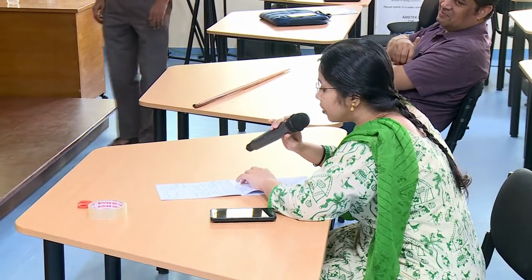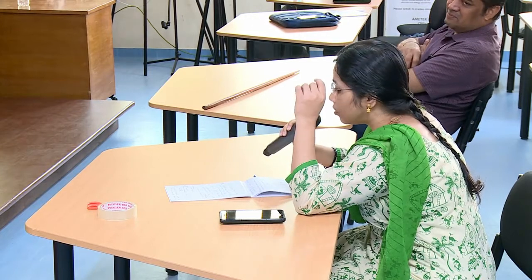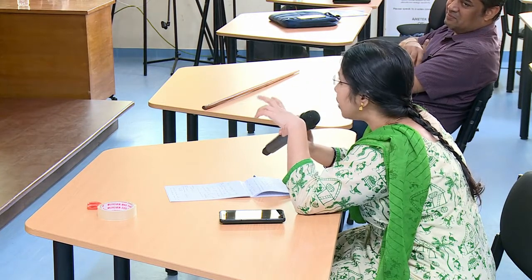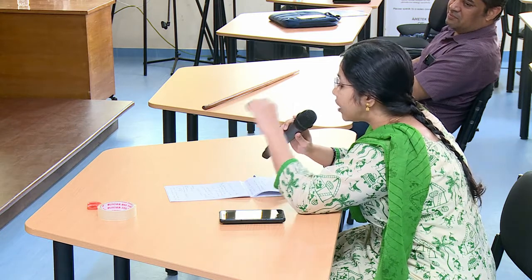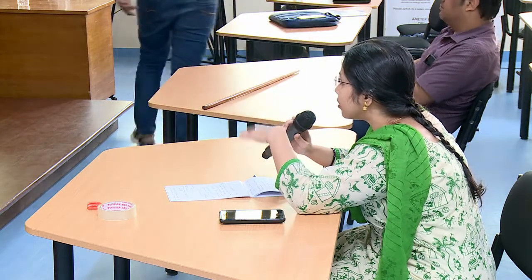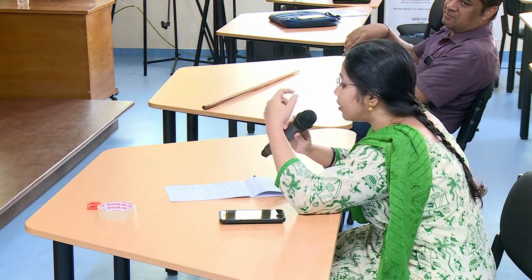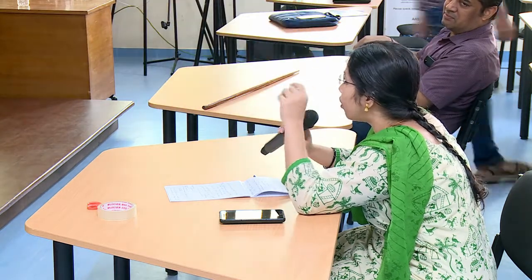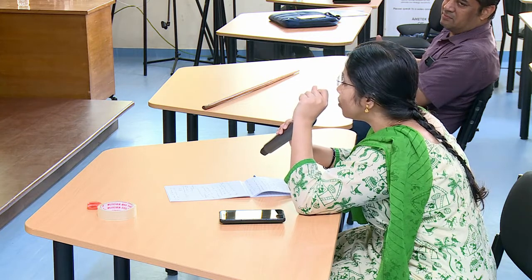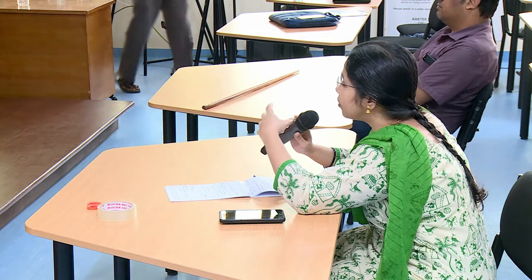I have a question related to the pseudo symmetry which was talked about in yesterday's talk. I have a Laves phase, C15 Cr2Nb Laves phase, in my material, along with multiple phases. When I tried to index the Laves phase with the existing standard files that were available, I was not able to get it indexed. I tried to generate a pattern, but it was just coming as dots. It was not indexing properly. Do you think this Laves phase is not indexing because of the pseudo symmetry, or could there be any other reason?